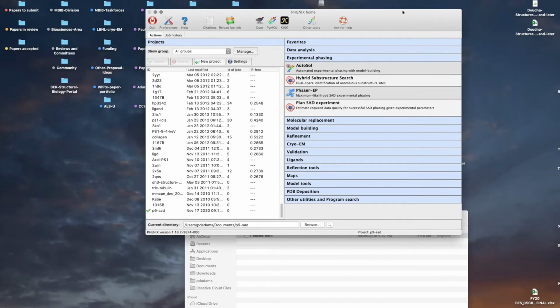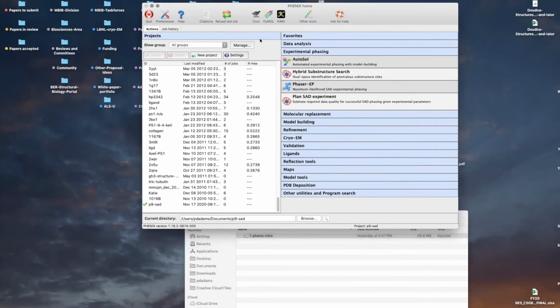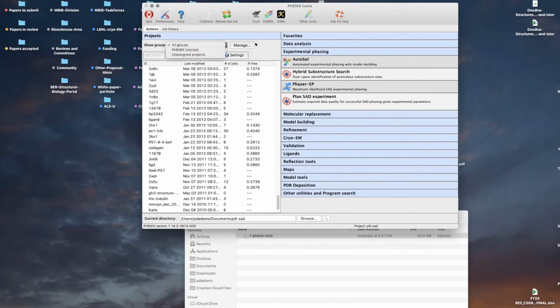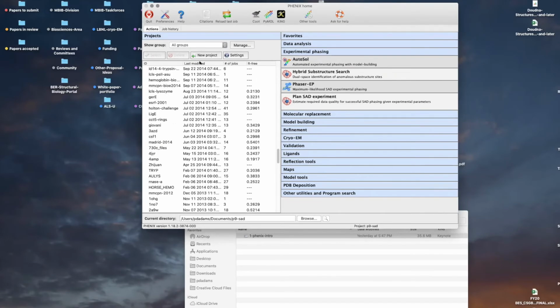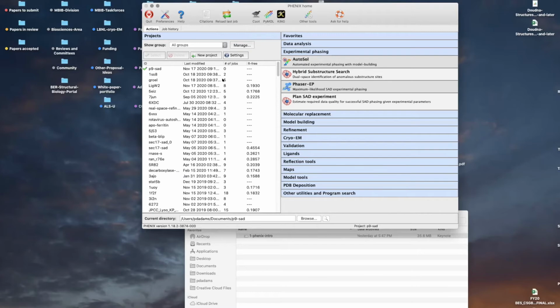Yeah, and if you click on last modified in the left-hand side in the middle, then it'll sort them in that order. And so then the one with your check mark should come up to the top. I can't see it in Paul's, but if you go down just above, yeah, right there to last modified, double click on that, then it should sort them for you. Maybe, I can't see a check mark on anything. Right. Yeah. So if you double-click the heading that says last modified, then they'll be sorted by modification. Right. Yeah, there we go. So that's the check mark there next to P9 SAD.